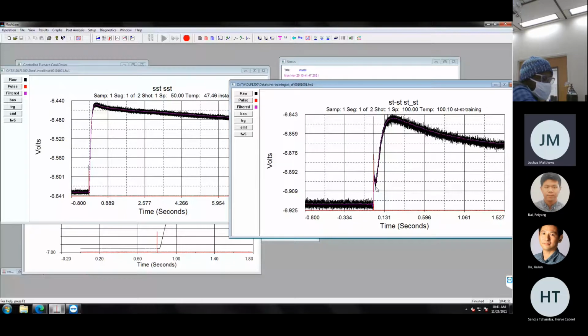If you're running a test and it's not finishing for some reason, or it's not giving you a good diffusivity value, you might have a sample prep problem. And remember that they need to be opaque and painted with that graphite spray to absorb as much of the light as possible.